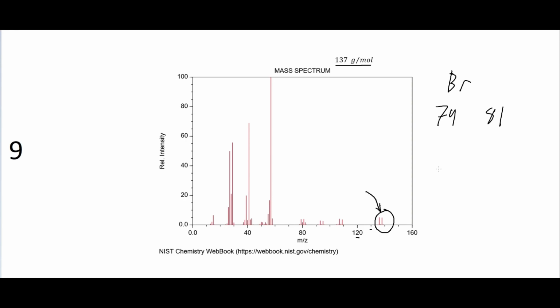And so you will get those same-sized peaks where this one will show up 2 after this one. And you can then see these other peaks here. So we have that one, and that one, which are probably alkyl bromide fragments. So alkyl fragments that break off and still have the bromine attached to them.